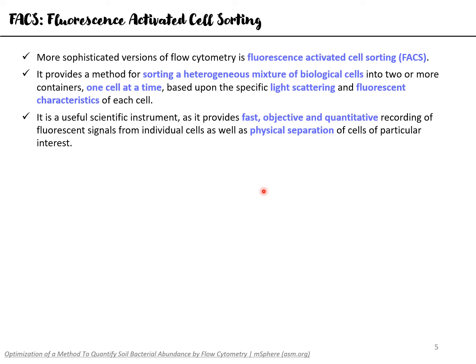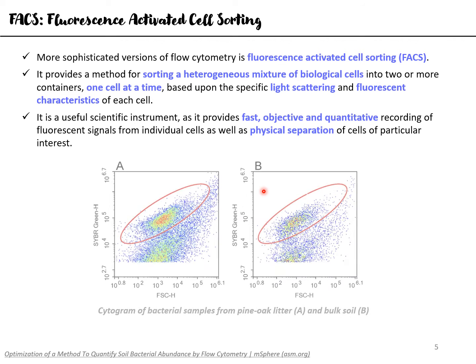So the best way to do that is by doing a FACS assay, where you take your blood cells, you prepare the suspension, you let it pass through the machine, and you obviously, prior to letting it pass through the machine, incubate it with antibodies specific for the specific markers, and then this machine will simply sort out this specific population of cells, and you can then do further experiments and further analysis with it.